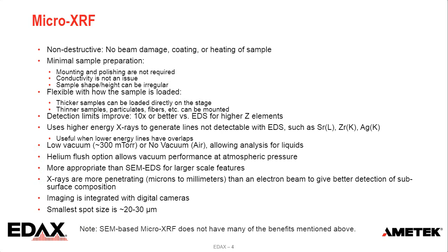Large samples cannot be accommodated in this system. So my point is, having a separate benchtop micro-XRF is a more flexible approach.